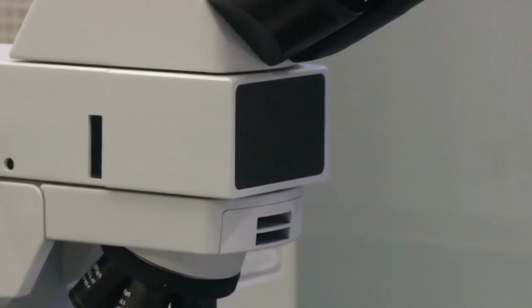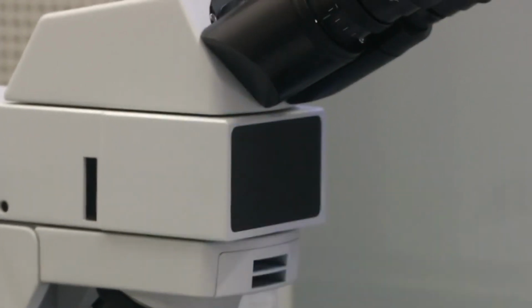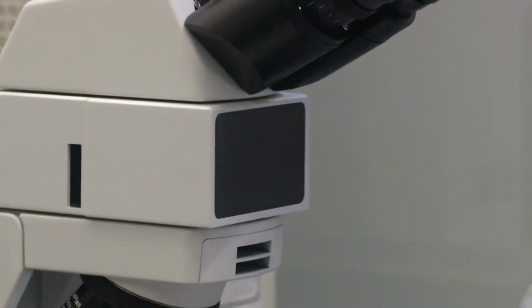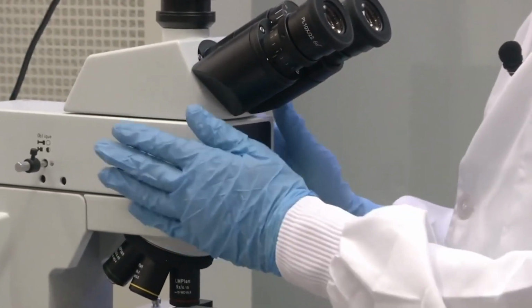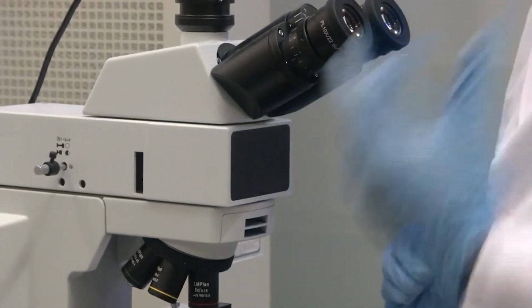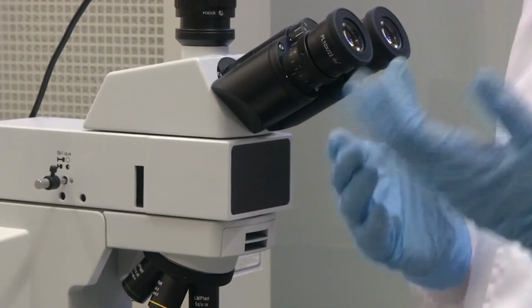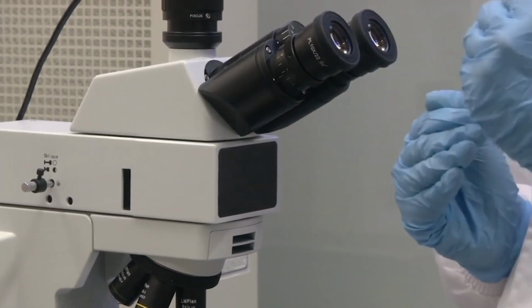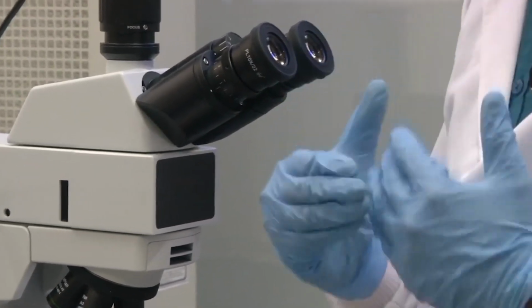You can see, right? Similarly we have blue, less than 480 nanometer. Likewise you can use these filters, insert them into the corresponding slots in your microscope and use it. So when we tell this, we need to discuss fluorescence microscopy. There is a subclass of microscopy, fluorescence microscopy.